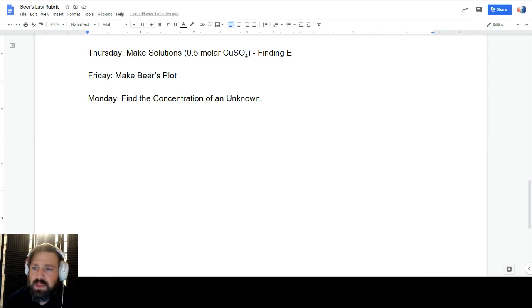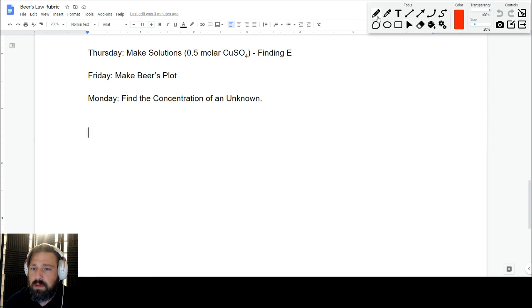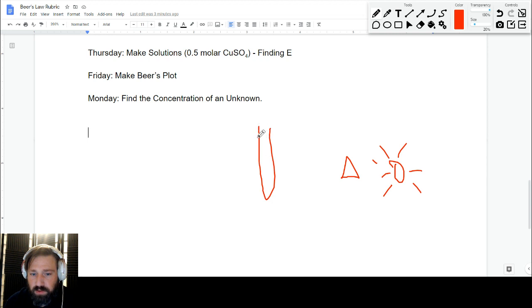So this idea: you have this thing called a spectrometer. A spectrometer is an instrument, a machine that has a light source. So this thing is a light source, right? There's a prism in it, okay? And then there's going to be your sample, your solution sample. There's my test tube with stuff in it. And then there's some sort of detector here. This detector detects photons. Okay, and that's basically it.